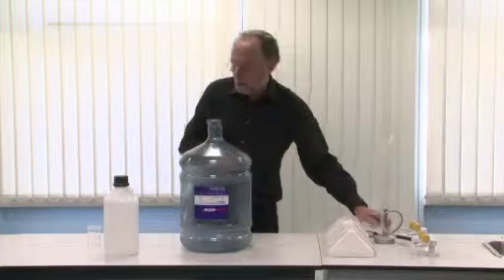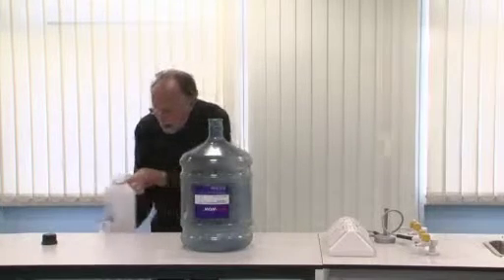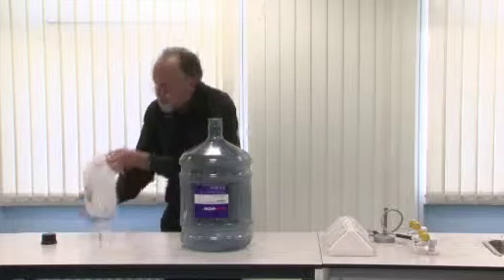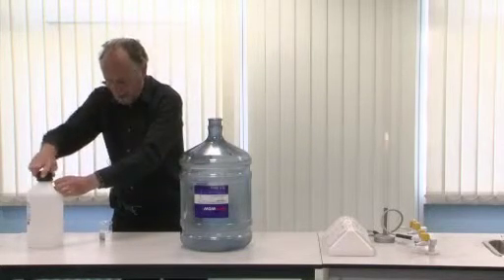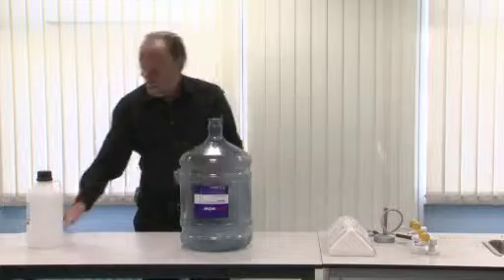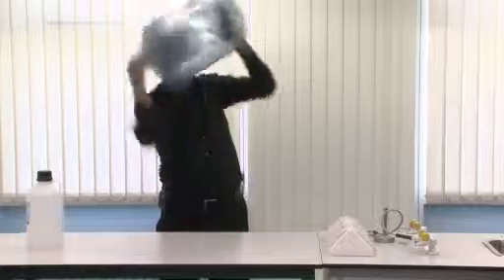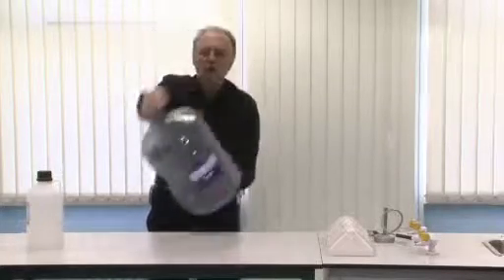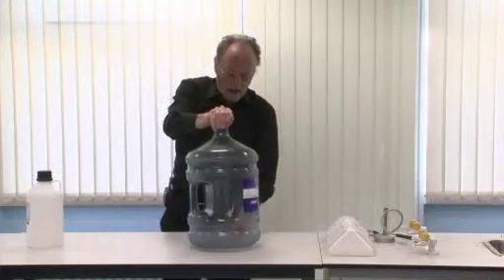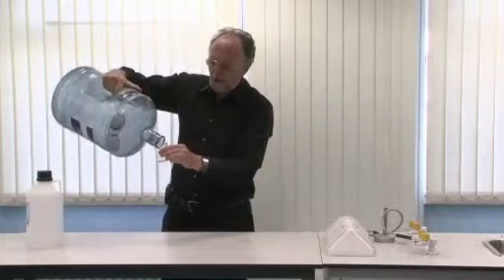All we need for this is a small amount of propan-2-ol. About 40 cubic centimetres is approximately what you need. That goes into the bottle and then you need to swirl it about to get a good coating of alcohol on the sides of the bottle and a good amount of vapour inside it. Then simply pour off the excess propan-2-ol.